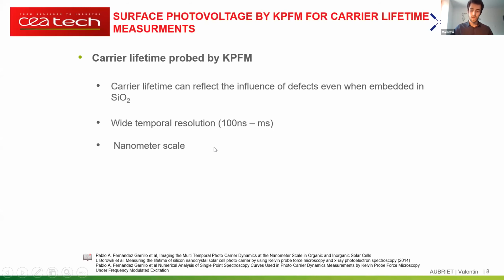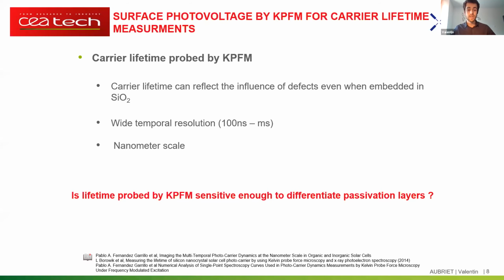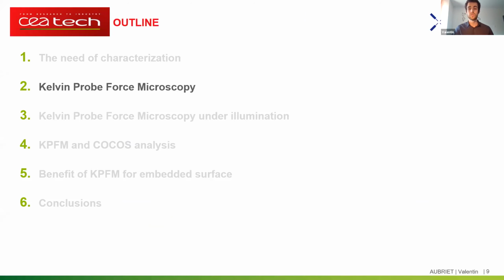At this point, we have two questions in mind. First, is lifetime probed by KPFM sensitive enough to differentiate passivation layers? And second, do we have defects only at the interface, or in other words, do we have a depth distribution of the defects? Now let's talk about Kelvin probe force microscopy.